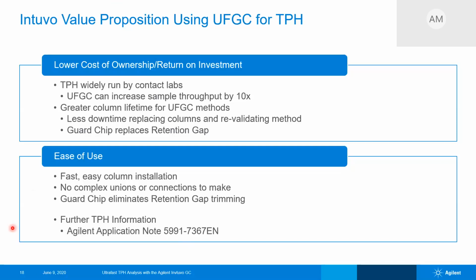Right. So when we did this application in 2016, the supply and the cost of helium had come down from previous problems that had happened several years before that. And in the subsequent time, the shortage and expense of helium has gotten worse again. So that's something that we definitely want to go back and take a look at. Now, based on other experience with converting methods from helium to hydrogen, this would be actually a fairly easy conversion.